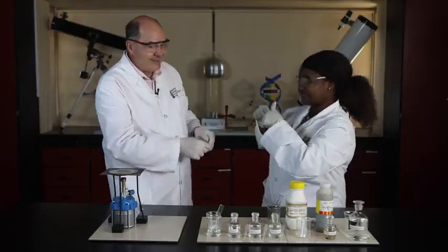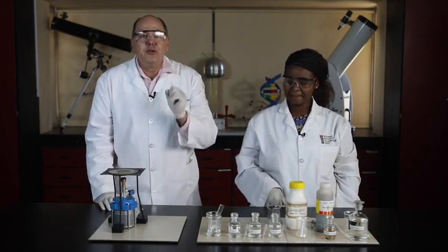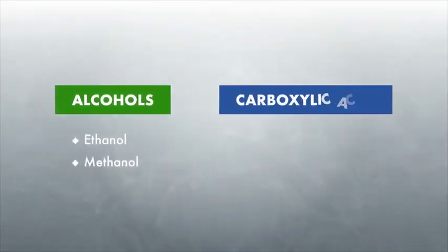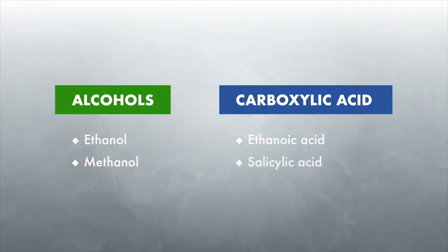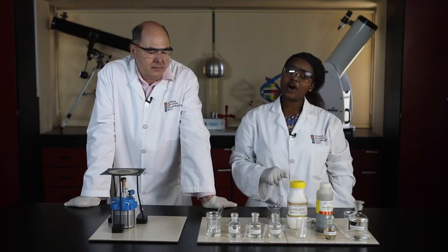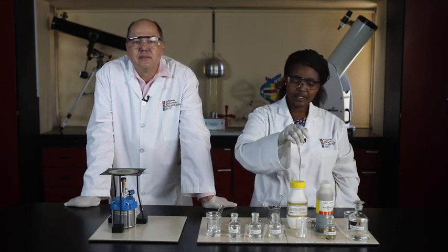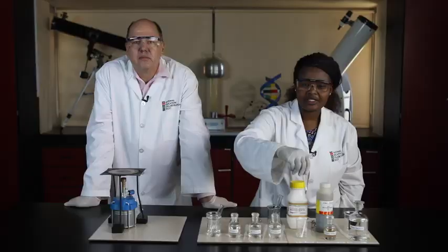Looking cool. Today we use ethanol and methanol as our alcohols and ethanoic acid and salicylic acid as our carboxylic acids. As you can see, all of these substances are liquid except for salicylic acid, which is a crystalline solid.